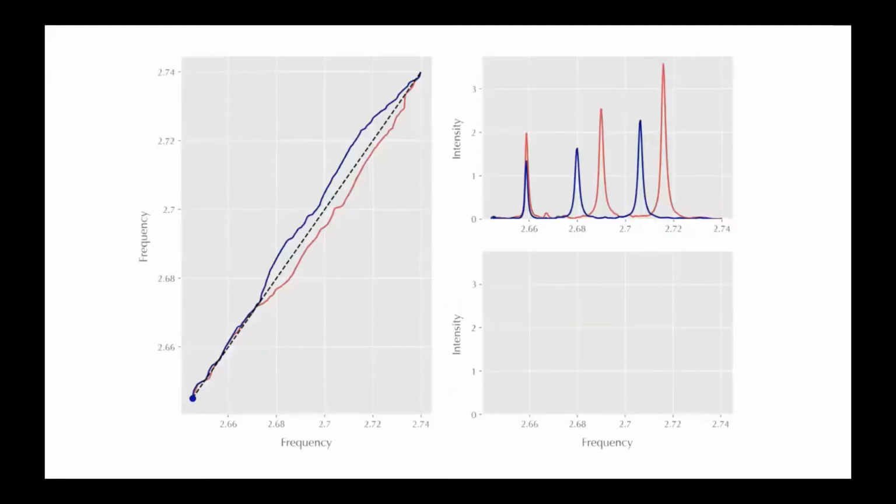So to demonstrate what registration looks like in practice, we're going to use the following example. In the top right, you see two spectra, in which we can clearly see both amplitude and phase variation in their peaks. And I've gone ahead and computed the inverse warping functions, which will align these two spectra, and these are shown on the left. Now this is how to essentially read warping functions. The dotted line on the main diagonal, that's the identity function, which fixes your spectra in place. They don't move any of the features along the x-axis.